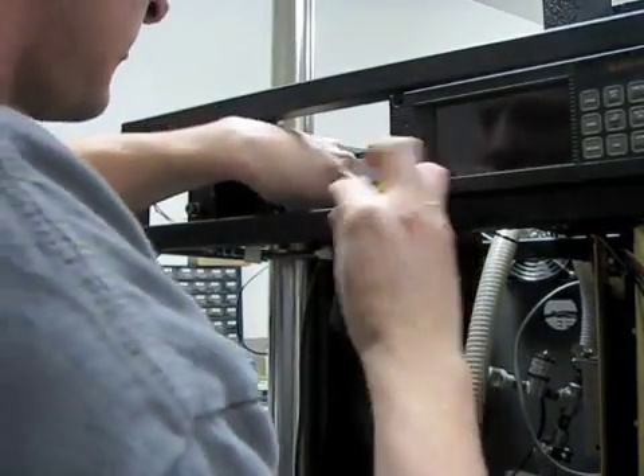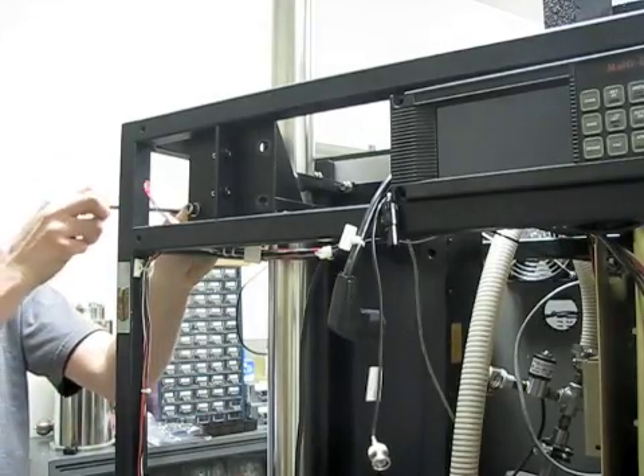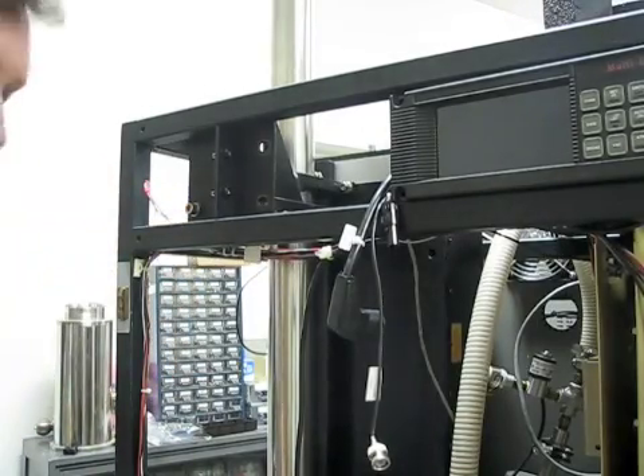You'll have to loosen the shipping bracket that is normally secured before the Voyager is shipped, as shown here, using the 3/16ths T-handled Allen wrench.